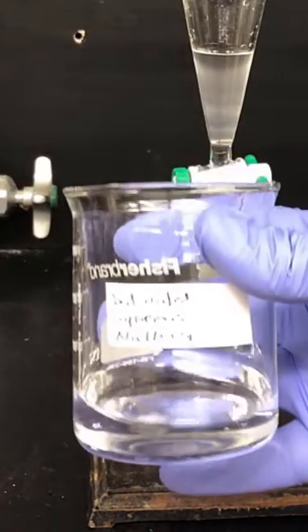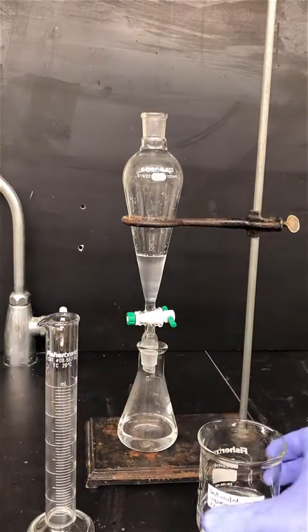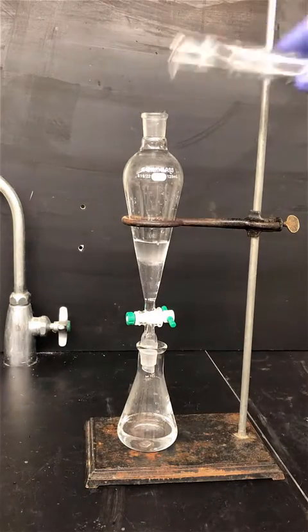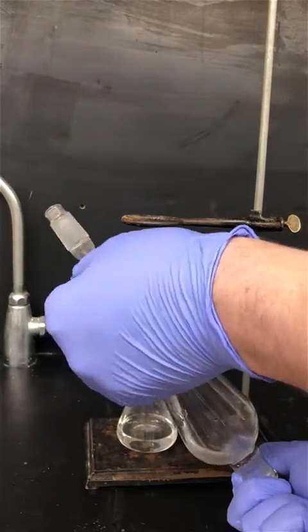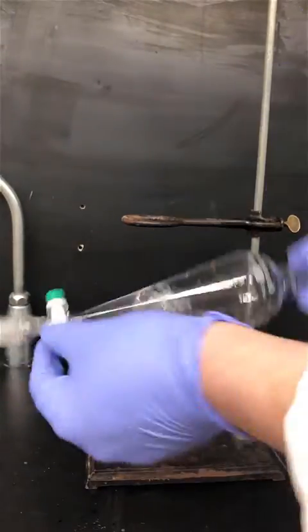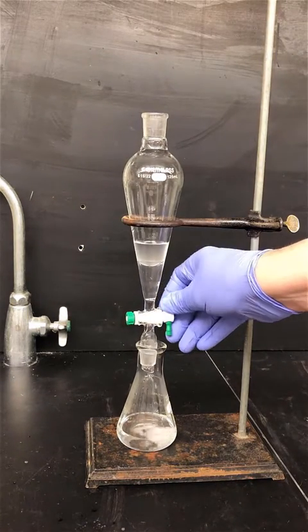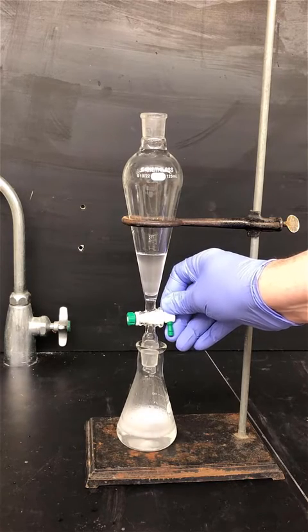Next we'll wash the solution with aqueous sodium bicarbonate. This is a weak base that'll help to neutralize acid — use about 12 milliliters of this solution. When sodium bicarbonate reacts with acid it produces CO2 gas, so in this step you have to be careful to avoid pressure buildup in the separatory funnel. Vent frequently to avoid pressure from building up. Drain the aqueous layer out of the bottom of the separatory funnel; you can see CO2 gas bubbles developing in the flask below.